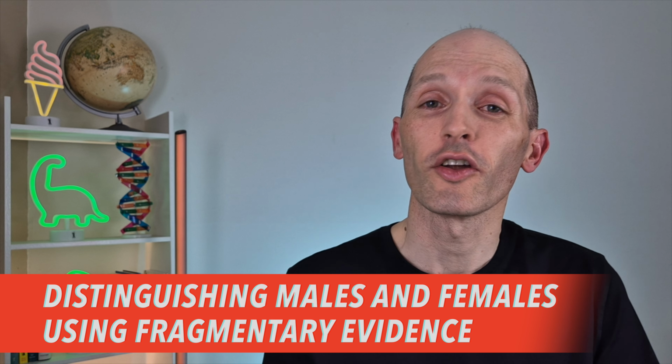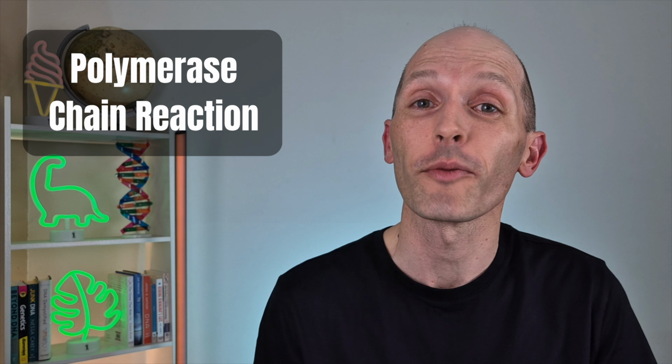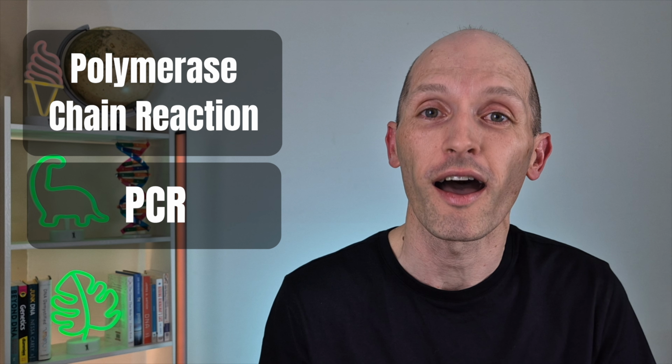In this section, I want to briefly look at a laboratory technique which is frequently used in medicine and forensic science and show how it can be used to distinguish between males and females. What I'm referring to here is the polymerase chain reaction, which is more well known by the acronym PCR.